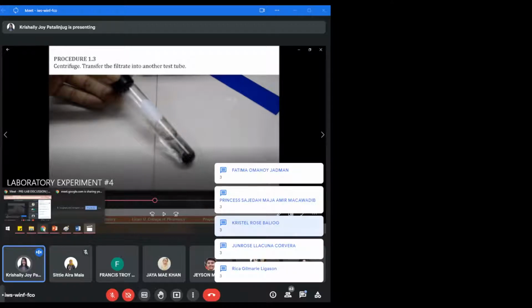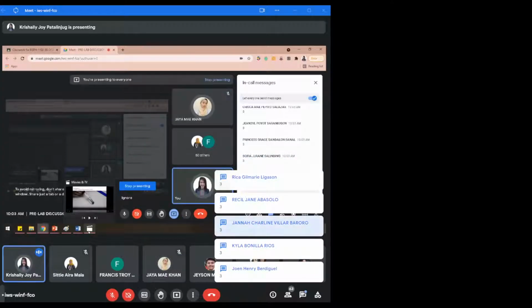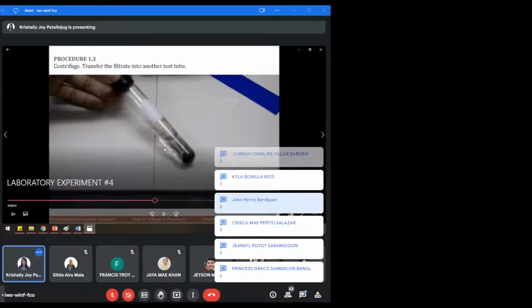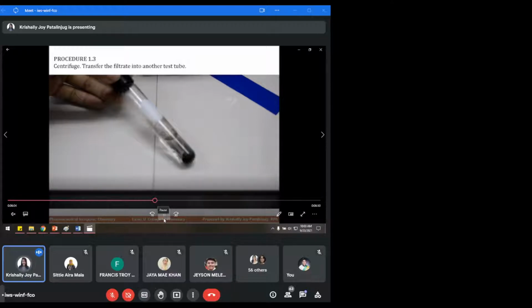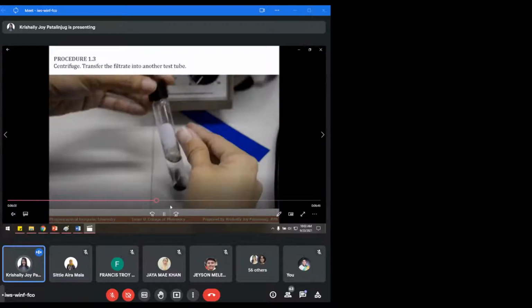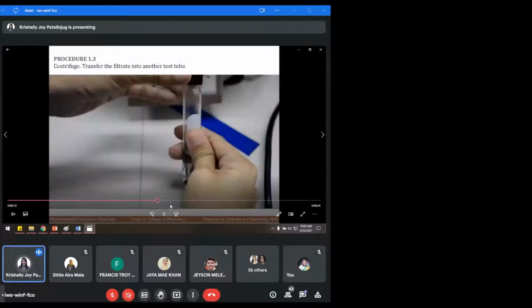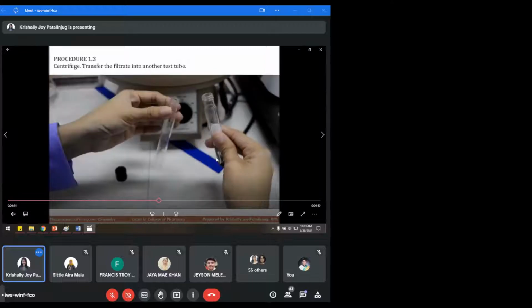Please turn off the microphone. Miss Can, yes, question. Okay. So this clear part, the filtrate, again, only three ions are left. We continue to separate. So silver is gone, cupric ion is gone, only three are left: zinc, barium, and sodium.